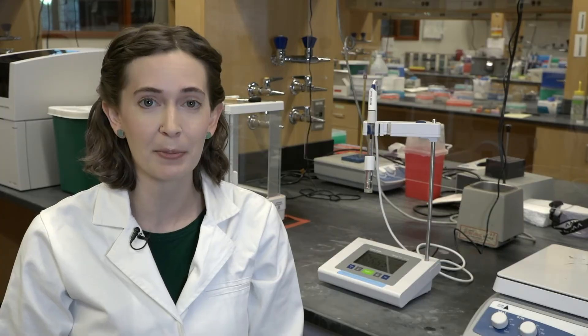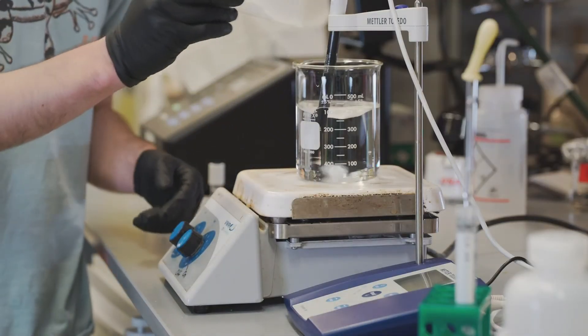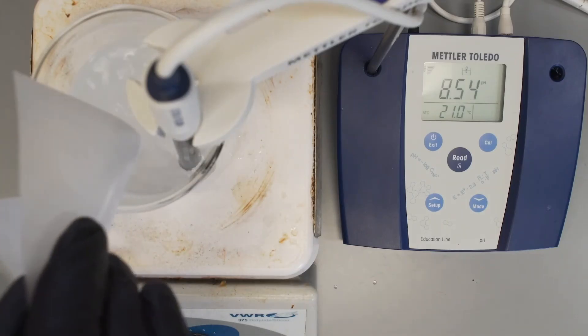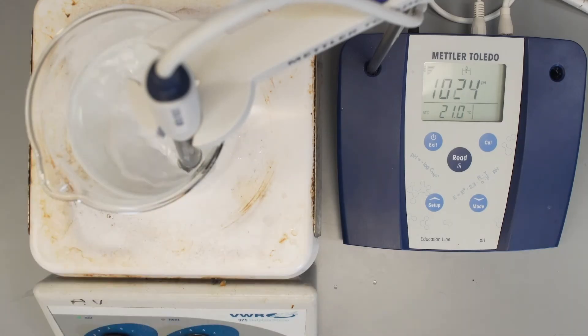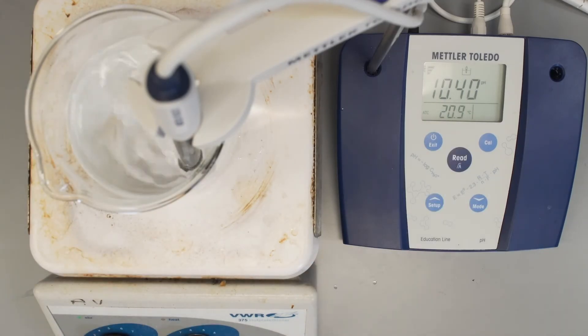pH meters are also super handy when you need to adjust your solution to a desired pH for an experiment. In this example, a basic buffer called Tris has just been added to the water. You can see the pH shoot way up and get as high as 10.5.